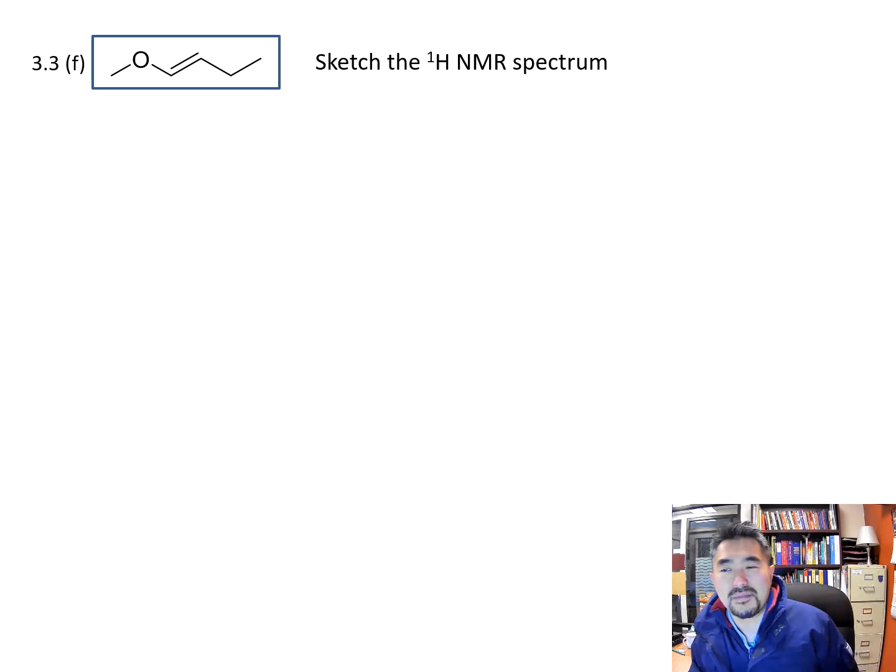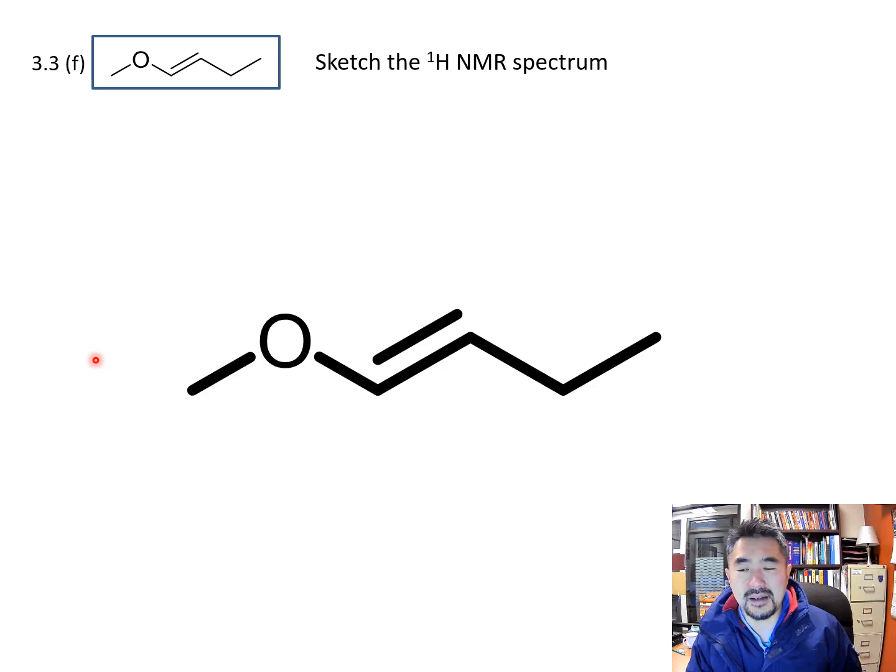So, sketching the predicted proton NMR of this compound. I think this is part of your dry lab assignment. If you're paying attention to this pre-lab lecture video, you actually already know the answer to some of the questions. So how do you do that? Well, I have to be careful because I haven't been able to figure out how to go back. But here's a blow-up of it. What do you do first? The first thing you should do is start noticing how many neighbors you have.